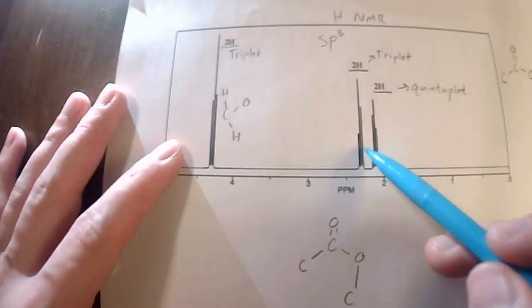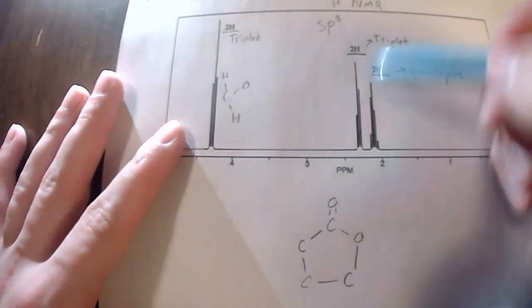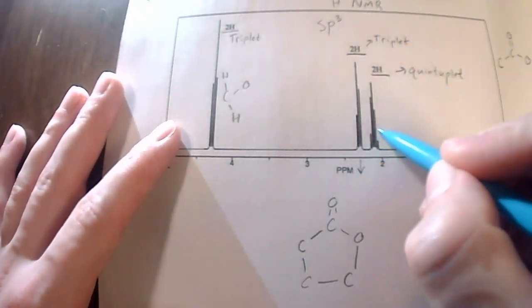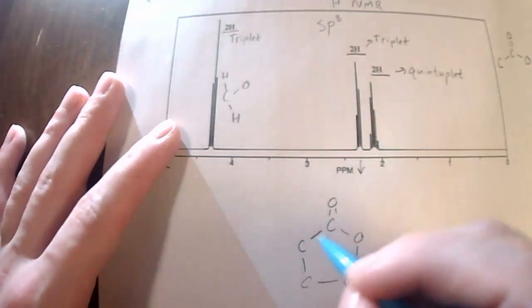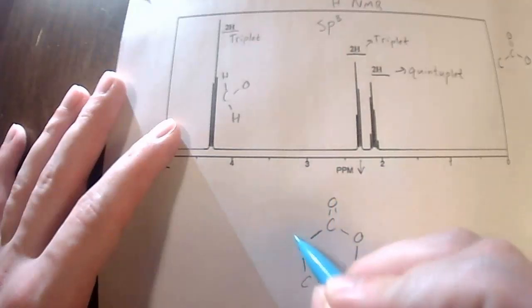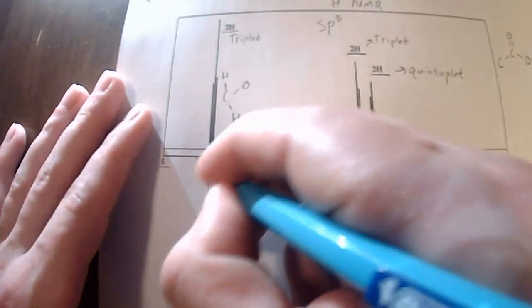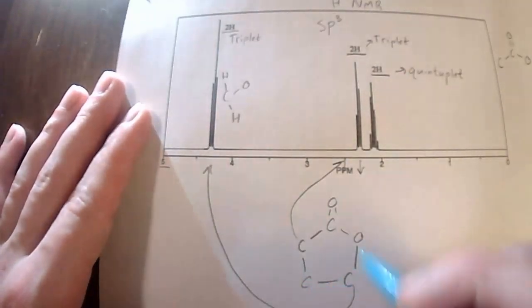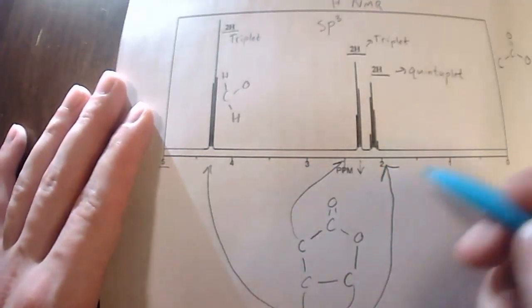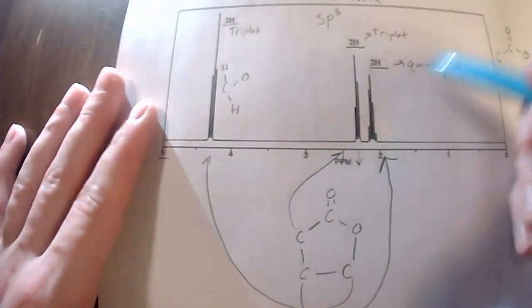Looking a little bit further, same as the CNMR, we will see that this triplet, since it's a little further downstream than this, means it's closer to the electronegative group, meaning that's associated. And that leaves our furthest carbon from the electronegative group being the most upstream, indicating a ring is our most likely final product, and this makes sense.